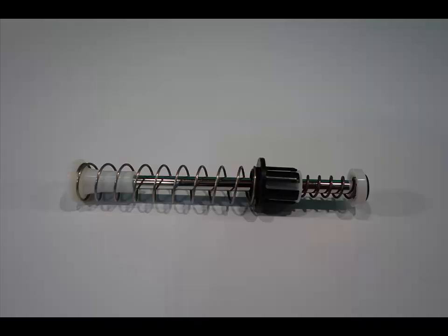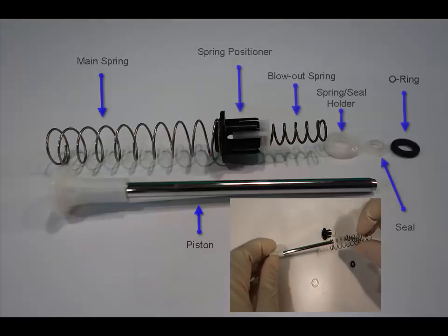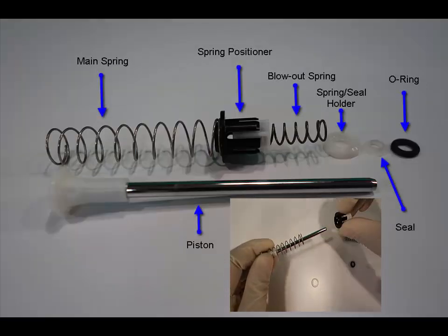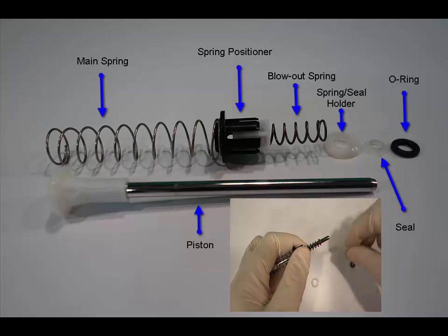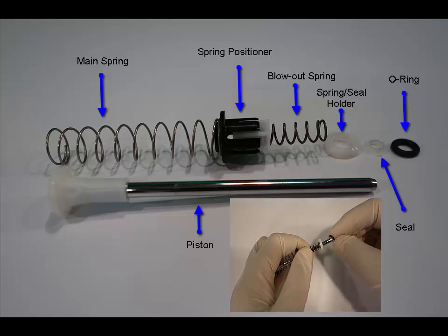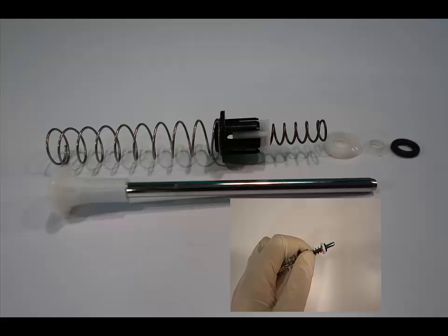Notice, pipettes with the seal and O-ring are assembled like this: the piston, spring, spring positioner, heavy small spring, spring holder, seal—the hat end faces to the end—and finally the O-ring is fitted over the seal.